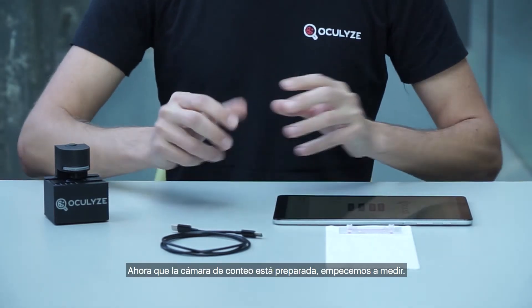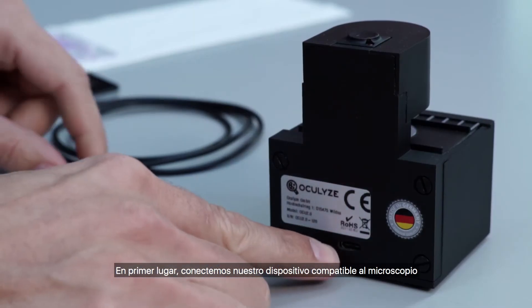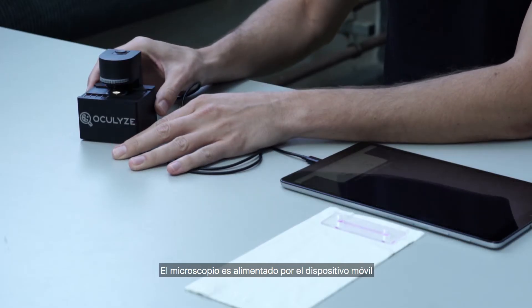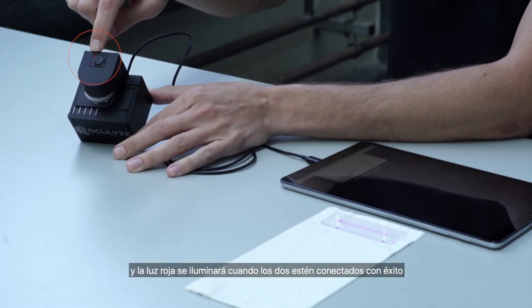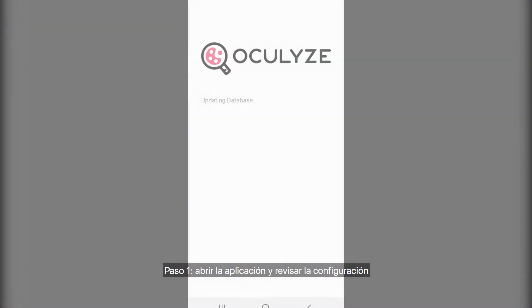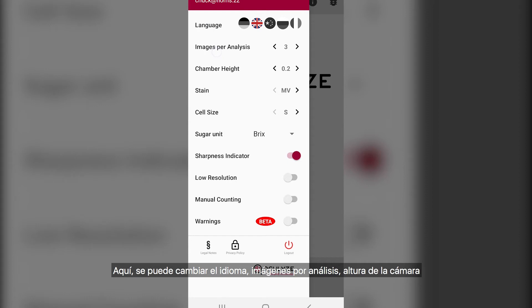Now that the chamber is ready, let's start measuring. First, plug your compatible device into the microscope. The microscope is powered by the mobile device and the red light will illuminate when the two are successfully connected. Step 1: open the app and check the settings. Here you can change the language, how many images you capture, chamber height, your choice of staining dye, cell size slider, units of sugar density, sharpness indicator, resolution, manual counting function, and warning options.